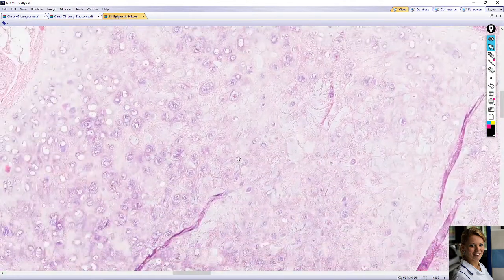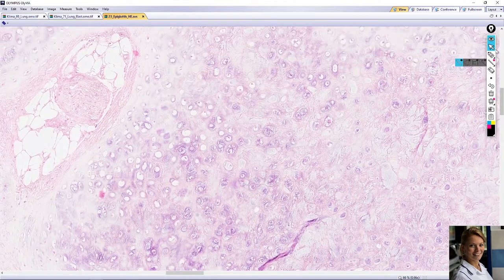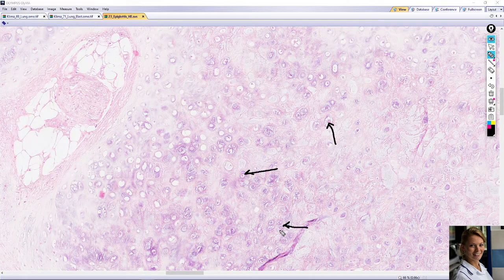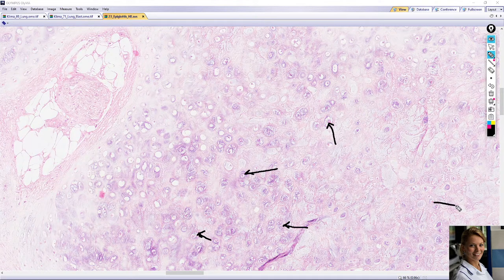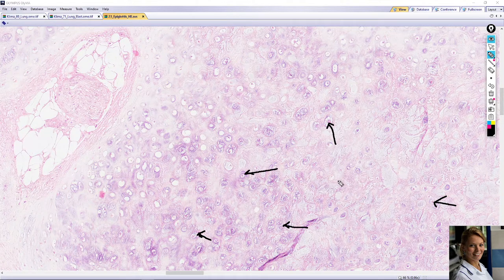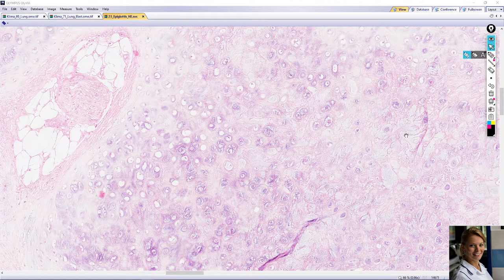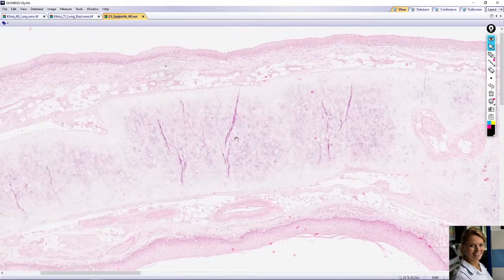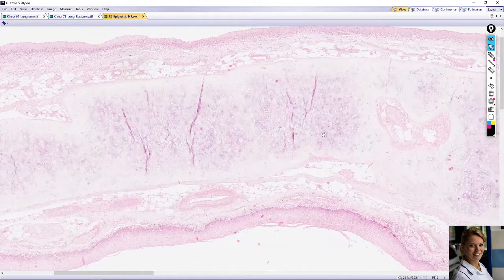In the elastic cartilage you can find chondrocytes — here — which form small isogenic groups. The chondrocytes are located in lacunae. Between the chondrocytes you can find elastic fibers and collagen fibers type 2. The matrix of the cartilage contains glycoproteins, proteoglycans, and a large amount of water.